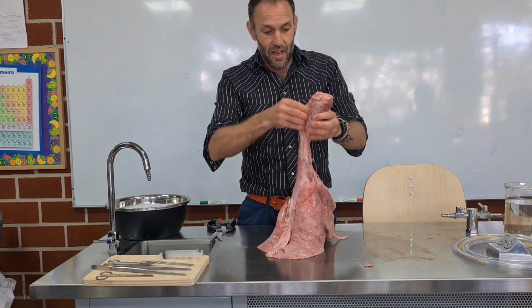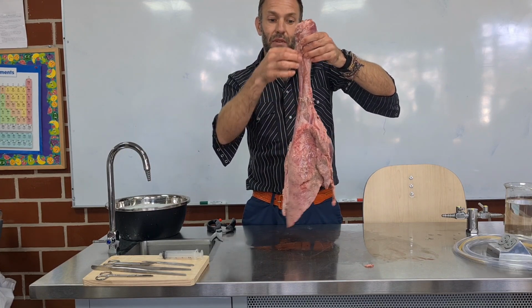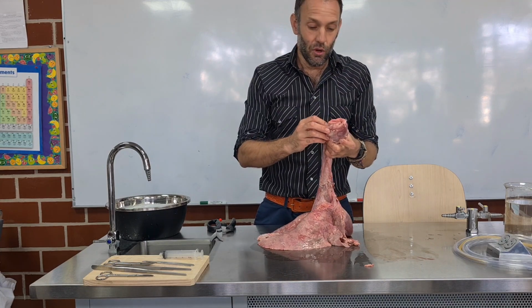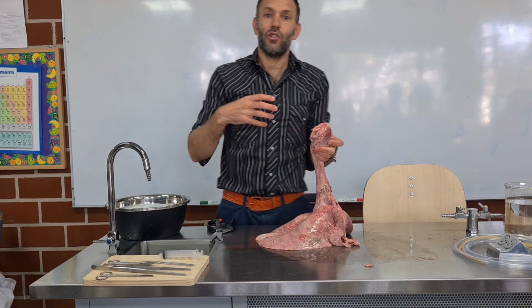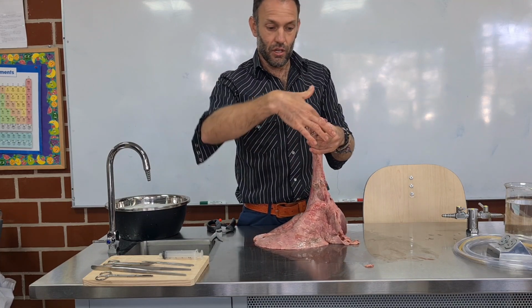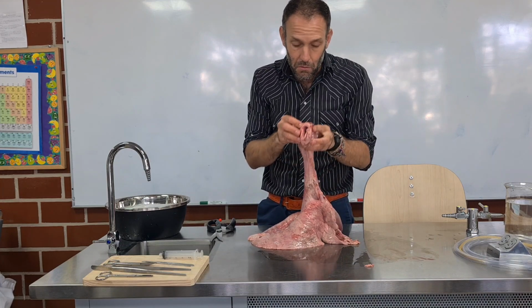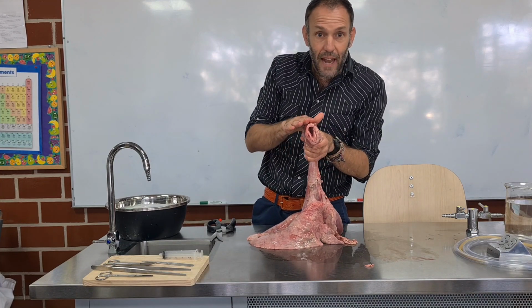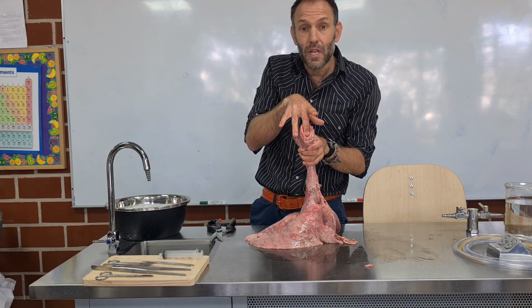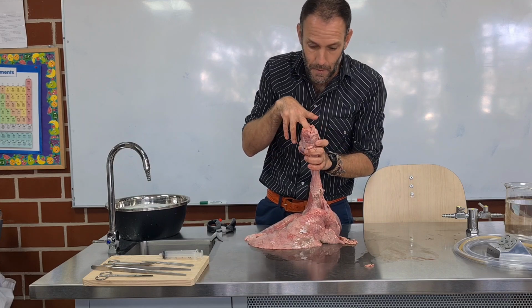And what we have, guys, as well, is two tubes. We have the trachea, as just said, and we have the esophagus here. So you may want to know, how does your body control which way the food goes? How does the food not go straight down to the trachea? Well, unfortunately, it's been removed, but normally there's a flap that covers the trachea when you swallow. That flap is called the epiglottis. Yeah?